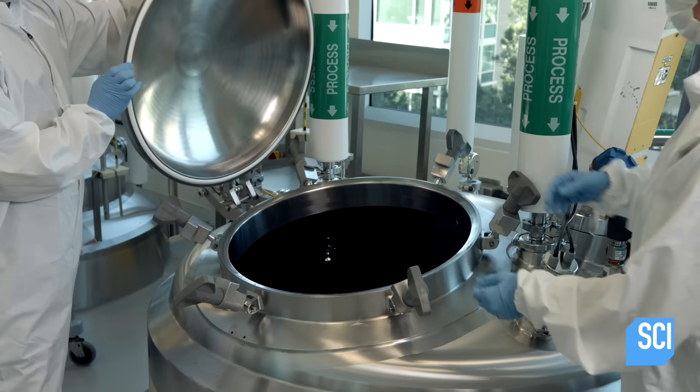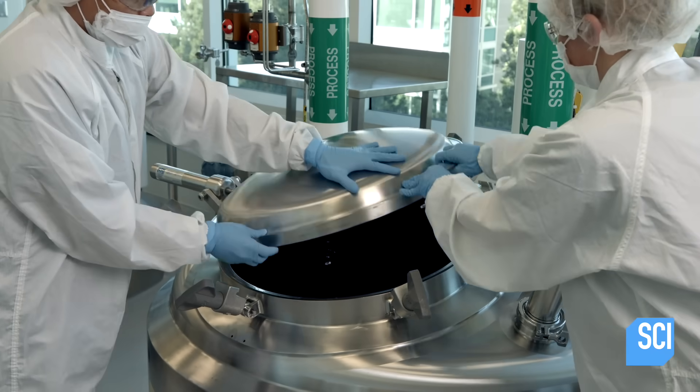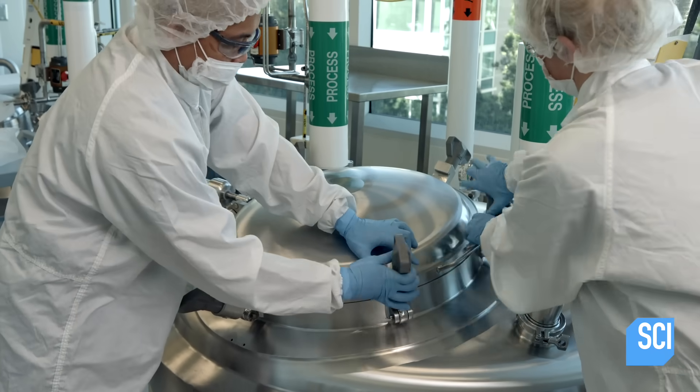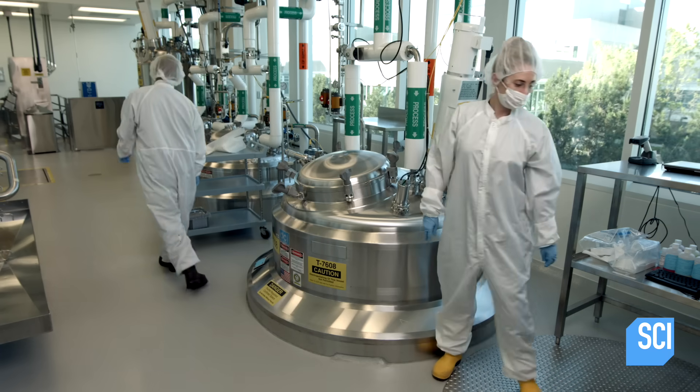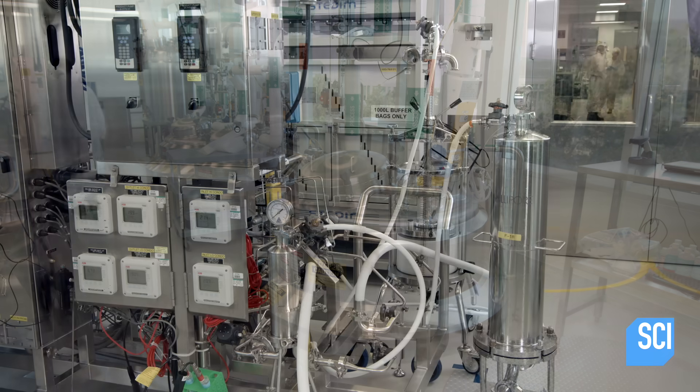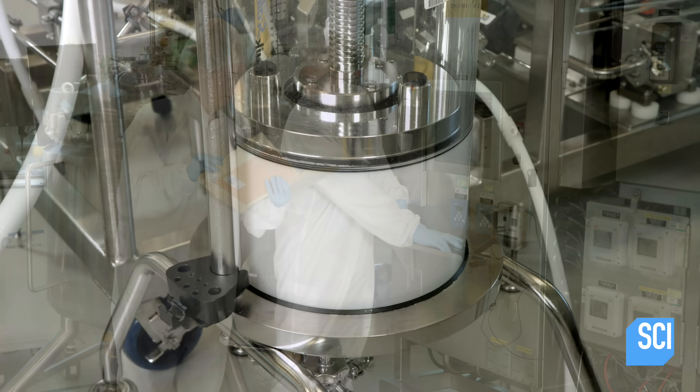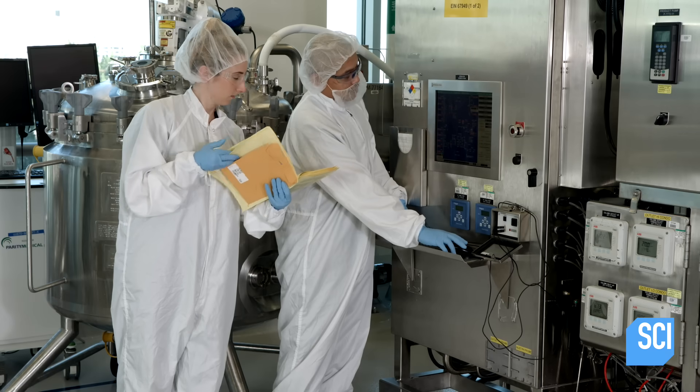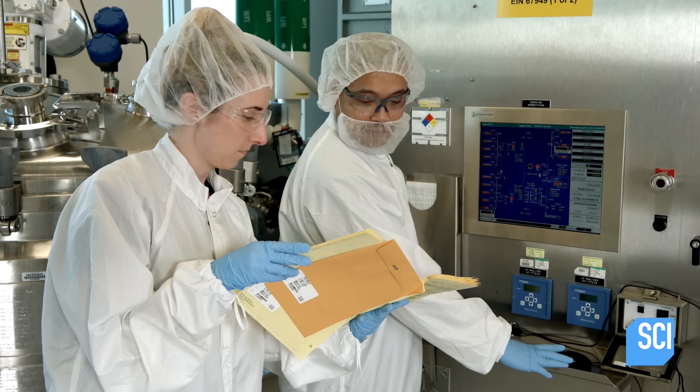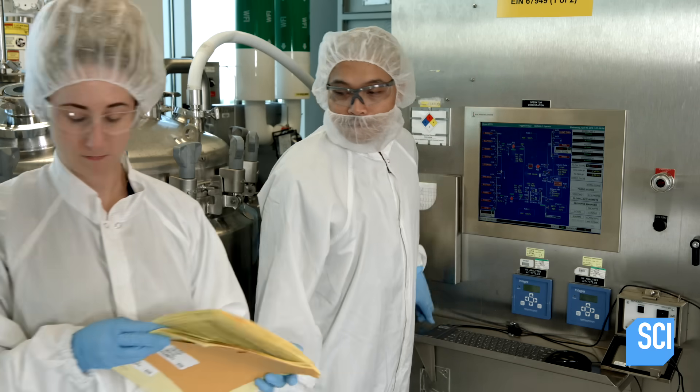An automated system keeps tabs on the condition of the purification solution. After separating cellular material from the protein mixture, the team pumps it through steel and glass columns. Here, the purification solution works with resin beads to separate the protein from the impurities.